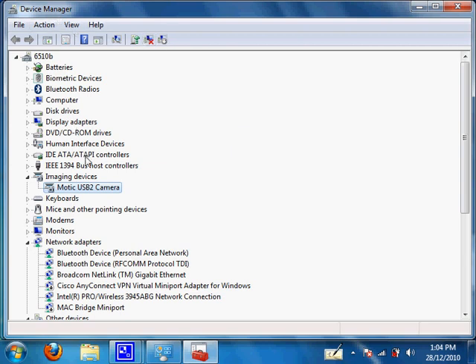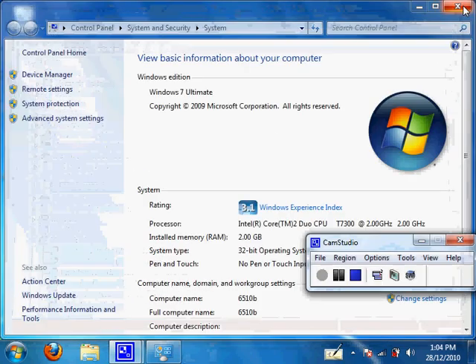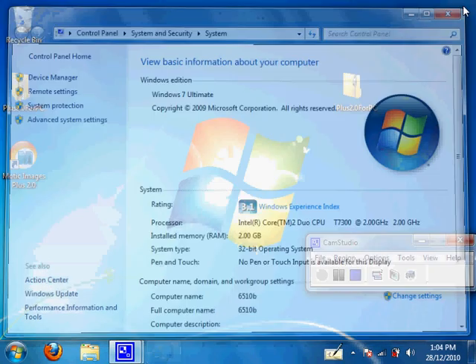And now, inside Device Manager, under Imaging Devices, your camera for your microscope or your Motecam will show up. In my case, it says Motec USB 2.0 camera.